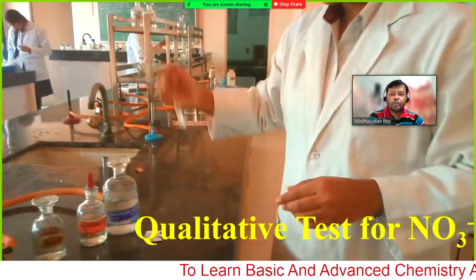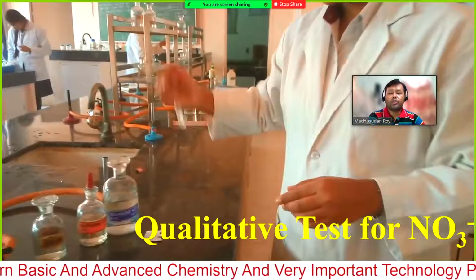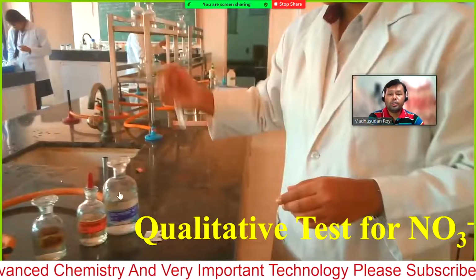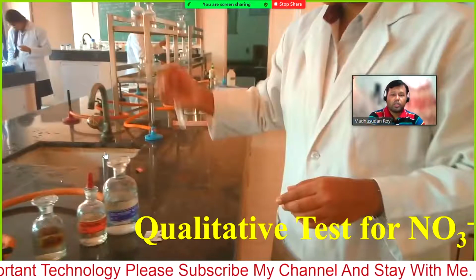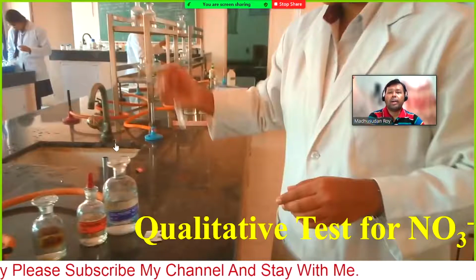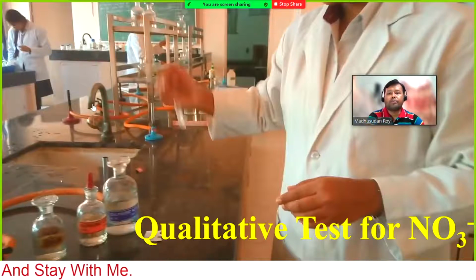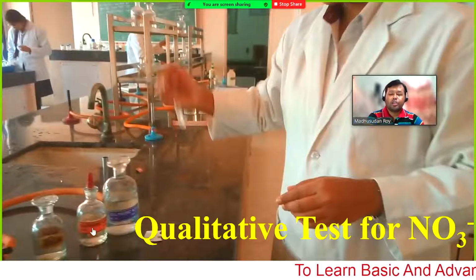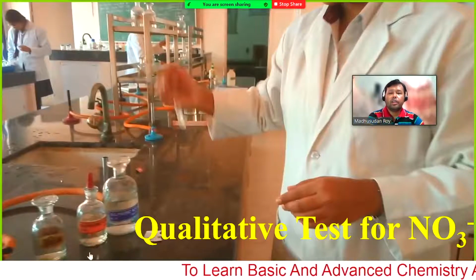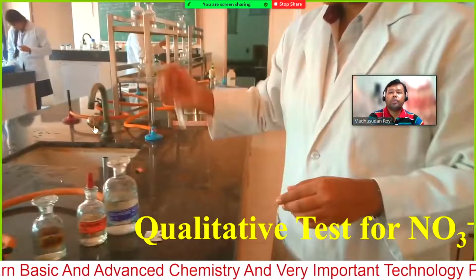In tap water you may have some nitrate, so you should not add water from the tap. You should always use distilled water, which is free from ions. Distilled water means there are no ions except H plus and OH minus. Let's see, still we may observe the result, because this tap water may not have too much nitrate, and our salt definitely has some nitrate. But we should add distilled water instead of tap water.